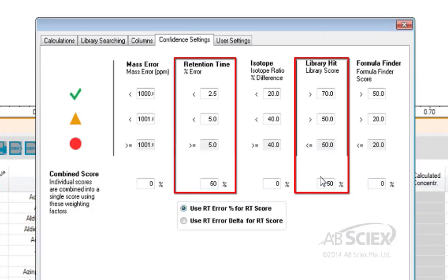Once these settings are entered into the software, they are saved for all future searches until manually edited.